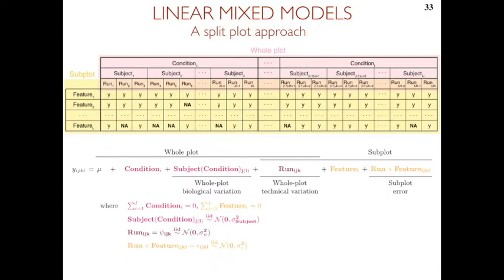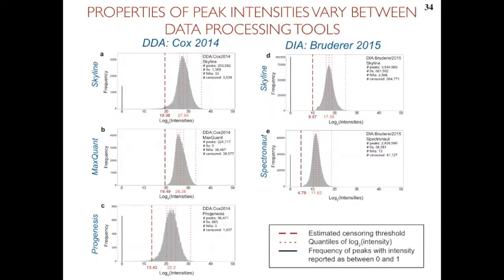So we take a data set. We start by finding the values that we don't trust. And we do this by establishing this cutoff, which is somewhat empirical, but it seems to work okay. Essentially we say that all the values below that will be treated as missing for reasons of low abundance, unless we are working with some tools which tell us that some type of missing values are due to other reasons, in which case we will leave them alone and will not do anything to them.